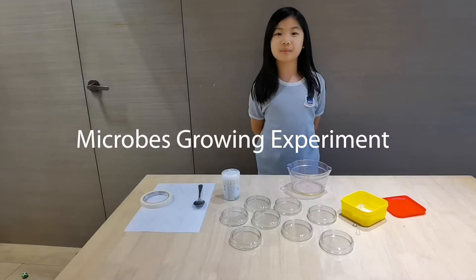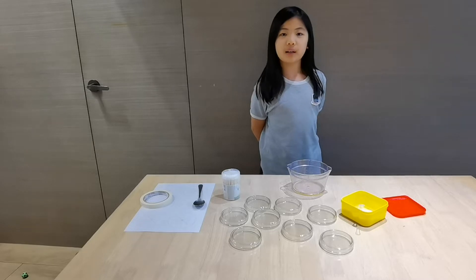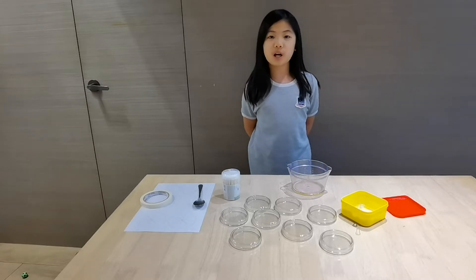Hi, my name is Izer from 4F. Today I am going to do an experiment about bacteria growing to see which objects in my house have the most germs.